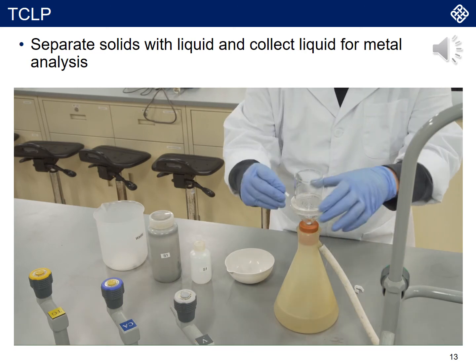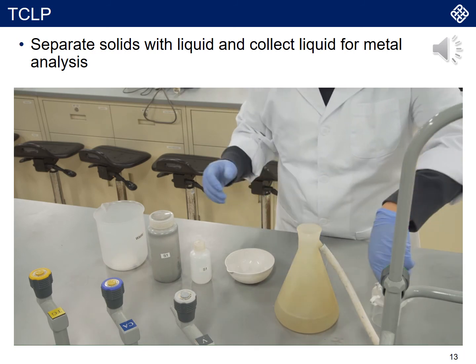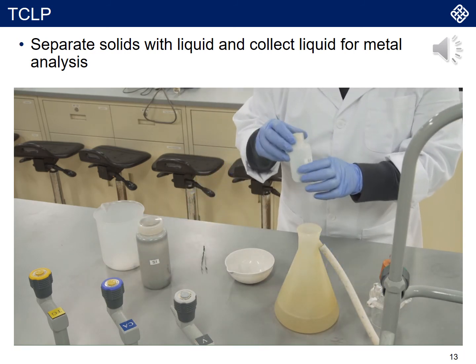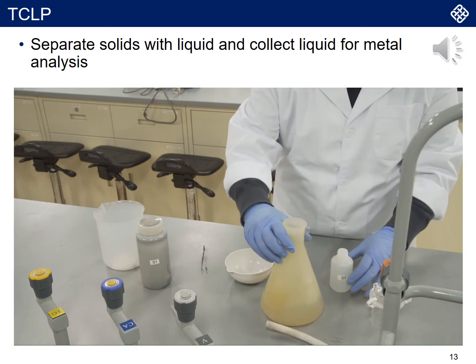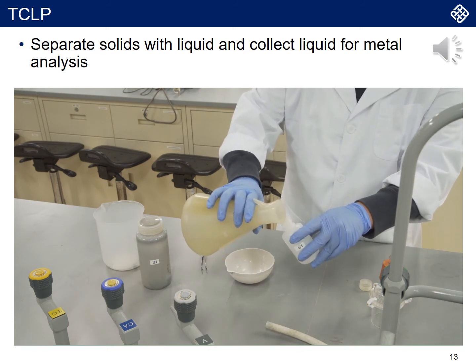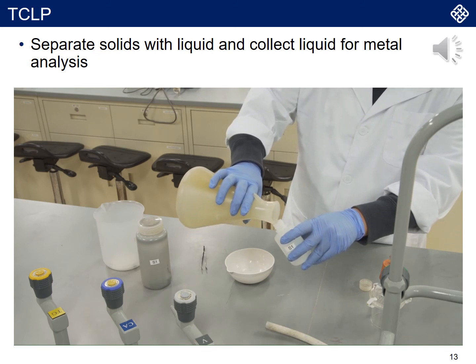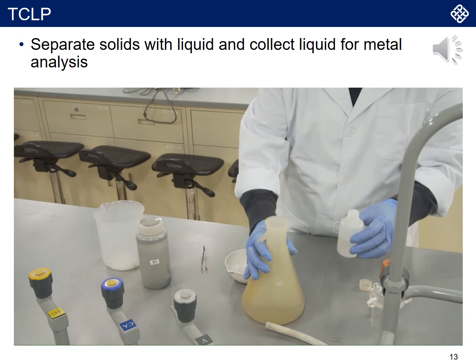As we mentioned previously, this solid compartment is supposed to be clean without heavy metal. But if there is some heavy metal, that means the acid or TCLP procedure is not good enough, and then we need to develop something else. So this is also the major purpose of the whole experiment carried out today.